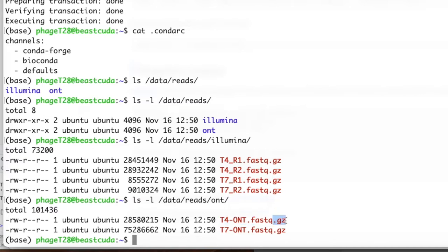The files are also compressed — the .gz extension means they are compressed with gzip. Most bioinformatics programs can read gzipped files without needing to extract them, which allows saving a lot of space. We'll have a look at these datasets later; now we will install the tools we need.